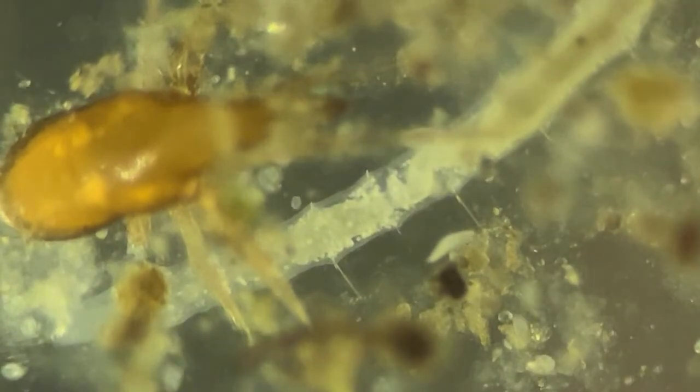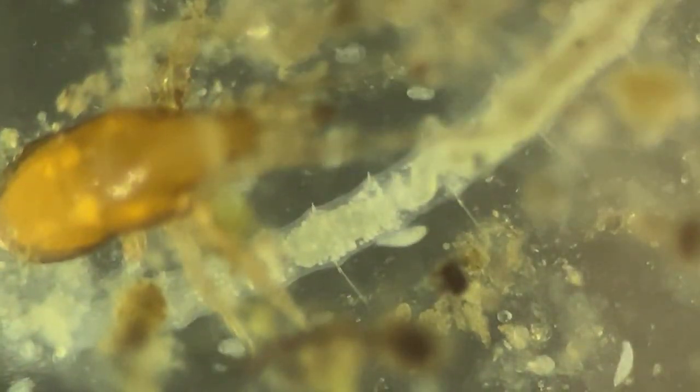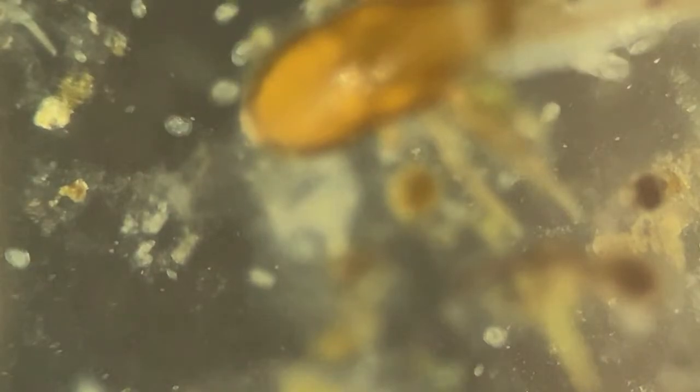See the stomach, the intestine, and then the spines on the body, the eggs within the body, and it is doing some occupation with that little tick, which is already dead, of course.